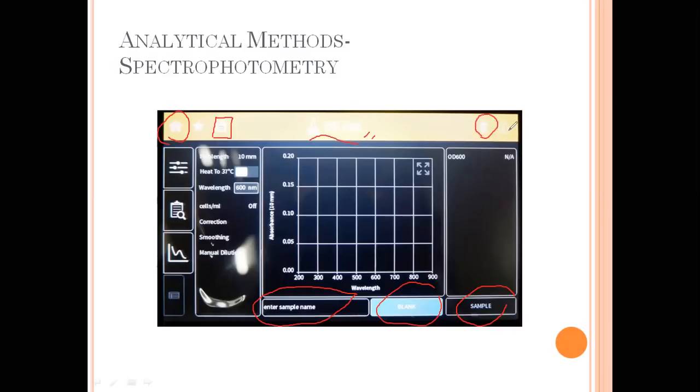I-delete mo ba? And of course, if you have any assistance or any questions. Okay? So, ito naman yung nandito are the different parameters that you can set. Okay? With this method, depending on the method. Sabi ko nga doon sa video, depending on the method are the parameters and at the same time, sometimes they have their default settings. Okay? So, yung sasabihin ko ngayon, same lang nung doon sa video kasi nga ako rin yung gumawa niyon. Iba nga lang yung boses. Okay? So, ayun. Going back with this blank sample and enter sample name button.